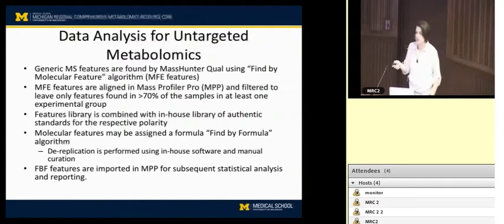Okay, so we have a couple different pieces of software from Agilent, and what Steffi was asking was if there's a difference in the feature extraction between two pieces of software. One is called Qualitative Analysis, and the other one's called ProFinder. My understanding is that the molecular feature extraction is the same algorithm. The recursion is slightly different. They have made some changes in the ProFinder version of it that supposedly are improved.